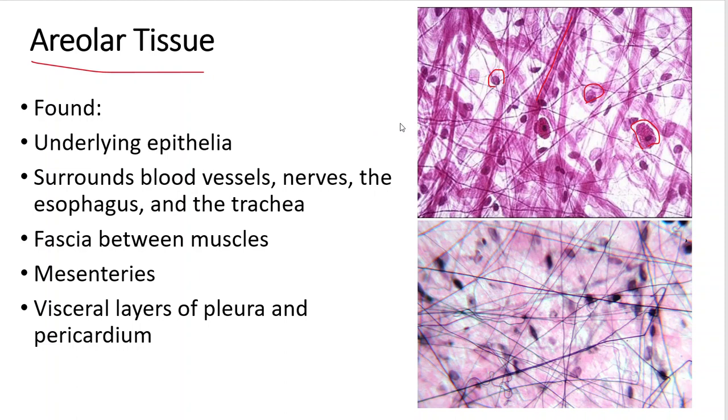But that's the ground substance. The ground substance is everything outside the cells, guys. That's it. And in this, it's very loose and open. There's not a lot of cells. Remember how epithelial cells is just one cell right after another in these big sheets. Connective tissues are going to be mostly ground substance with few cells.